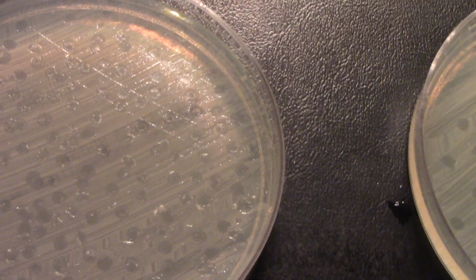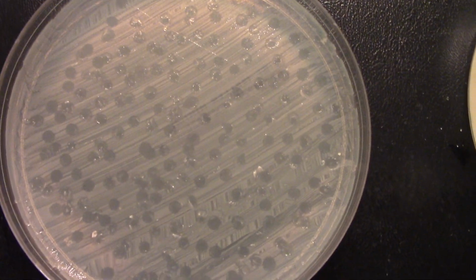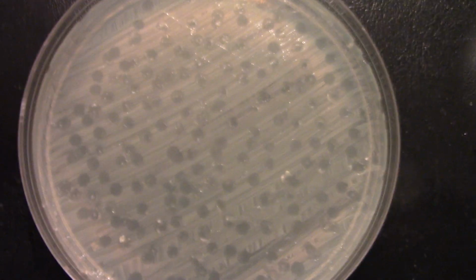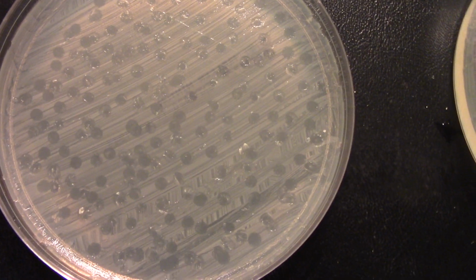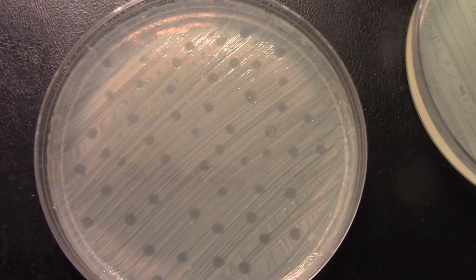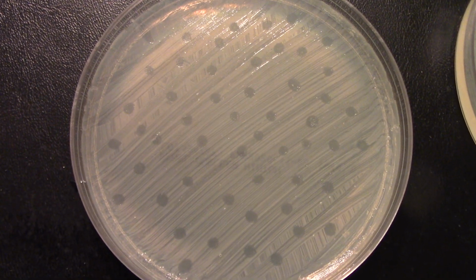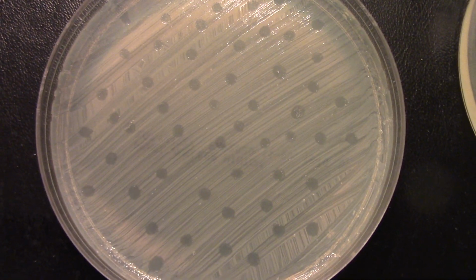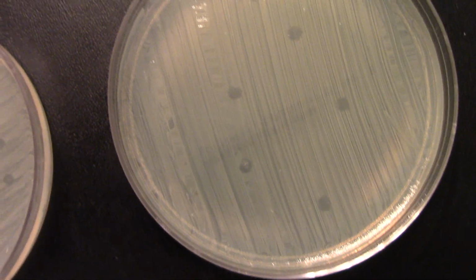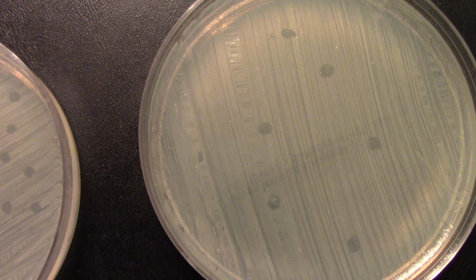This is tube number 2, and we can count those. That's a 10-fold dilution, tube number 2. No tube number 1. Here is our tube number 3, where we can count the number of plaques, those little clear areas. And then tube number 4, this is the number of plaques we have on tube number 4.